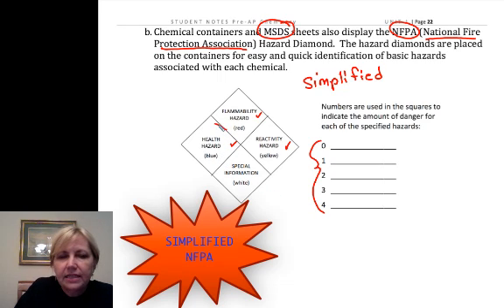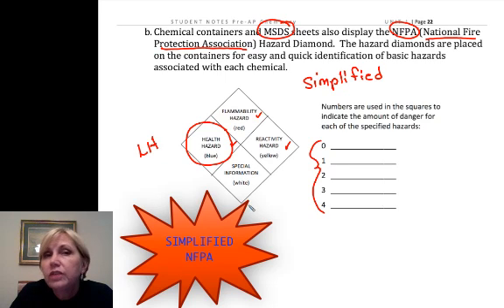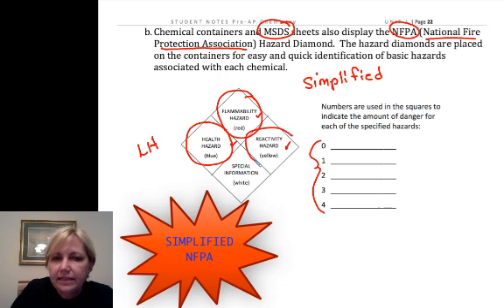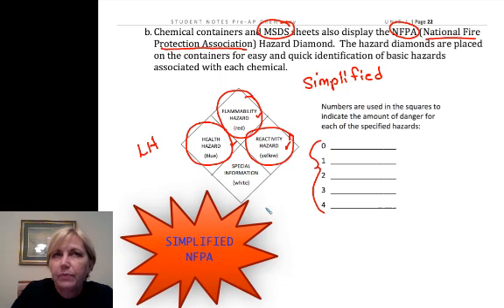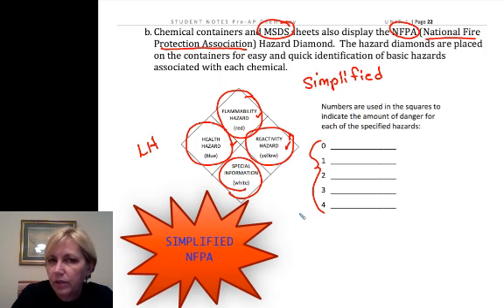The first is the left-hand diamond — you should know this by position, not just color, because we can't print in color on your quizzes. The left position is the health hazard. The top is the flammability hazard. The right is the reactivity hazard — how chemically reactive it is, like sodium metal in water being explosively reactive. And the bottom diamond is for very special information we want to communicate.